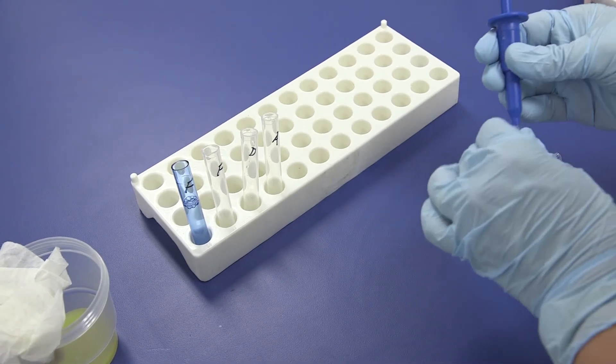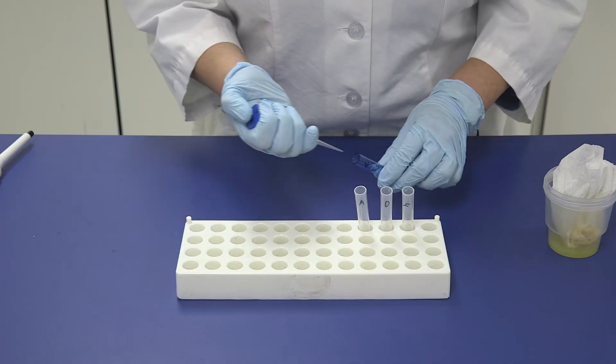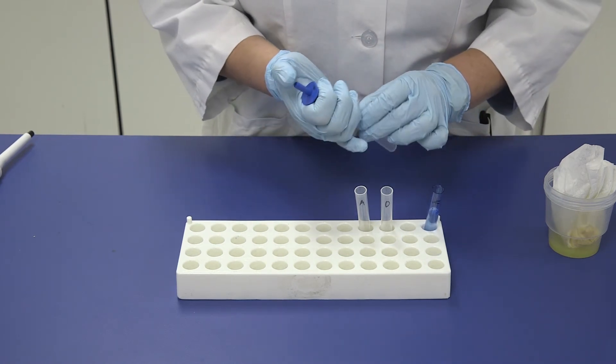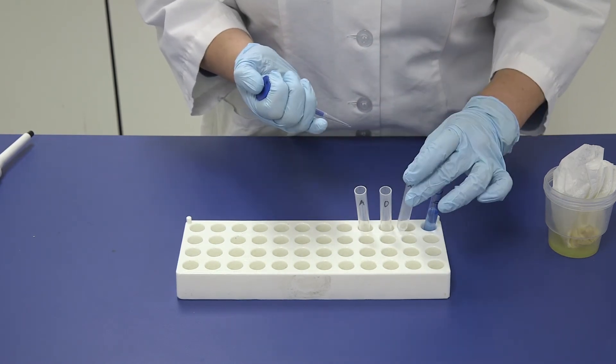Using the 100 microliter pipette with a clean tip, transfer two pipettefuls from the blue dilution tube labeled F to the clear reaction tube labeled F for a total of 200 microliters.